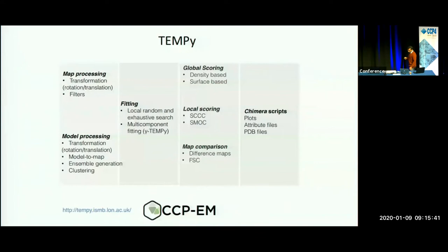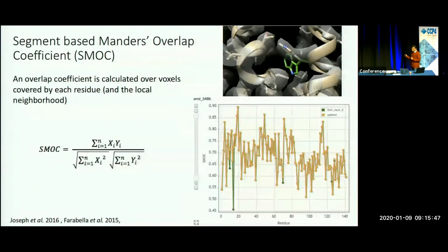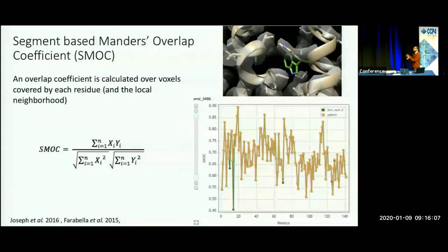One method in Tempi calculates the local fitness score of a model — it's the SMOCK score, which is the Segment-based Manders Overlap Coefficient. It's basically an overlap coefficient which tells you how good the fit of a model locally along the sequence. Here is a plot of the score along the sequence. I've manually introduced an error in the side chain fit — an obvious case of a tryptophan misfitted in the density. You can identify such misfits with local assessment methods like this.